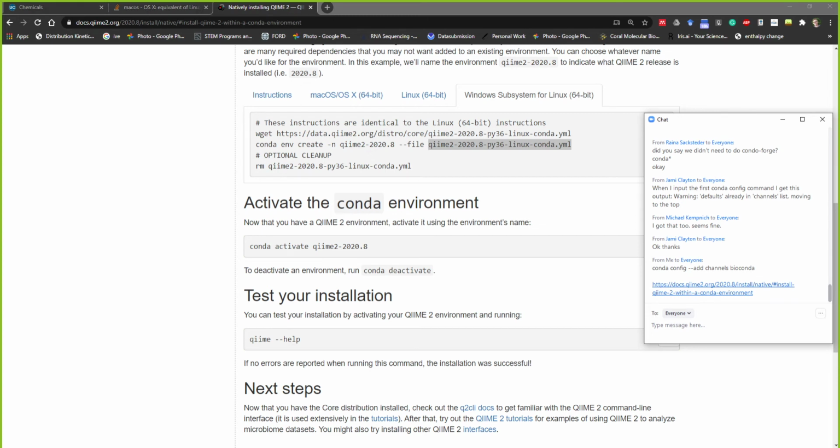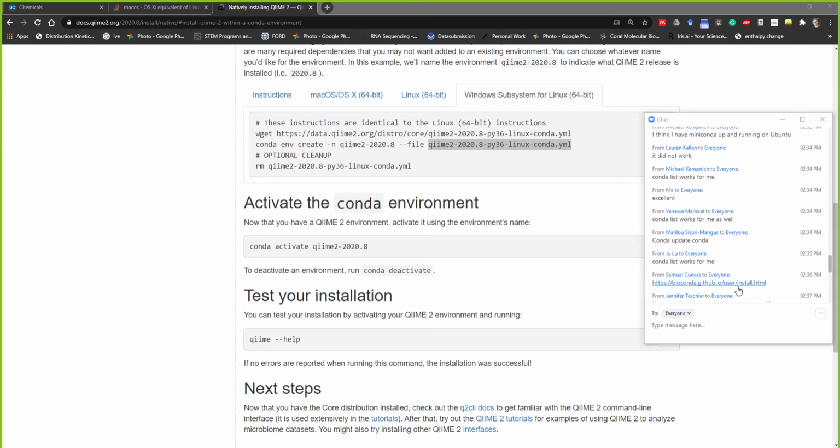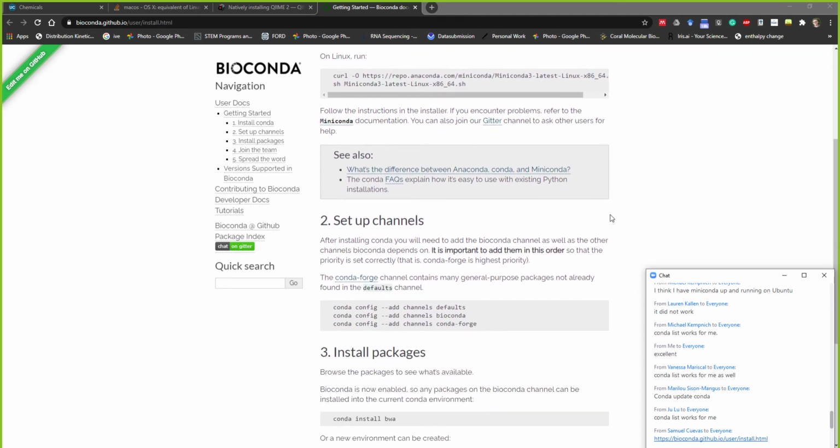It was uploading this entire time, and then it just stopped and said unexpected EOF. So I ignored it and tried the conda config command, and then it said no such file or directory. So I have a feeling that it did not download onto my computer at all.